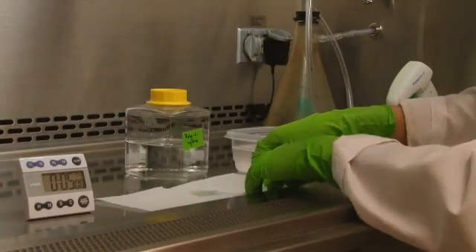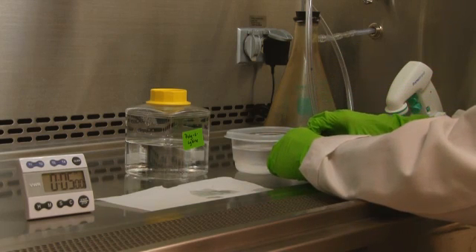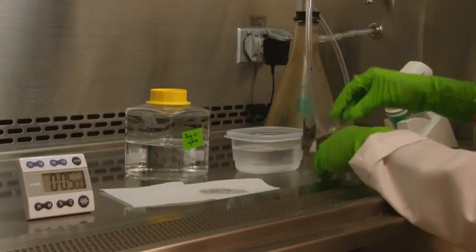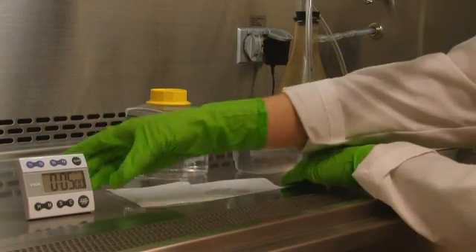As an optional step, you can place the cover slips into a subbing rack and submerge it in a 0.1 mg per ml solution of gelatin or polylysine for 5 minutes. These coatings aid in providing additional adherence of cells to the cover slips, ensuring they are not detached during later wash steps.